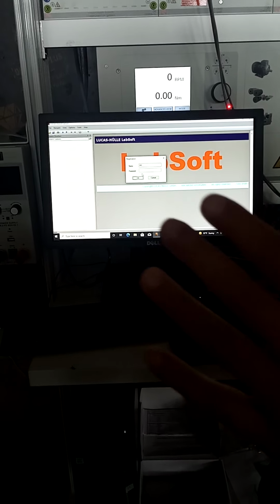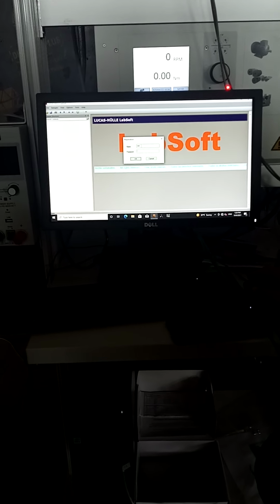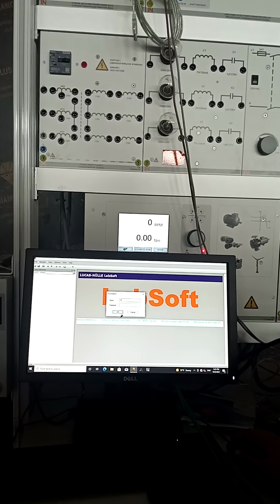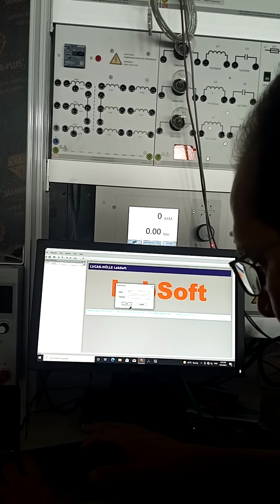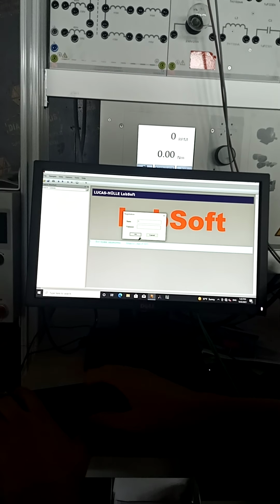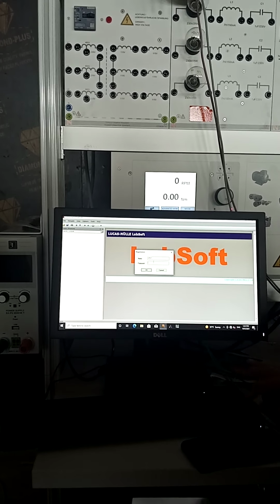If you have a user name, then it's okay. You can create a username only if you want to open the first time. For example, if I open this one, I make, for example, EPET. P for pin? Pen. Like that? Okay. EPET.